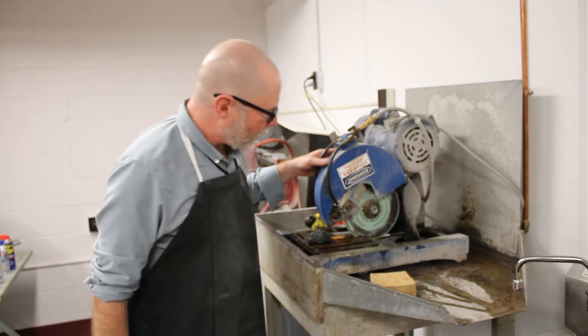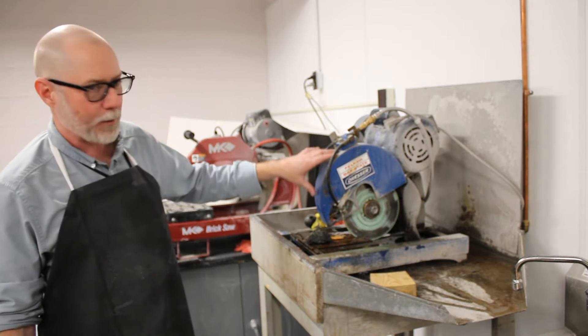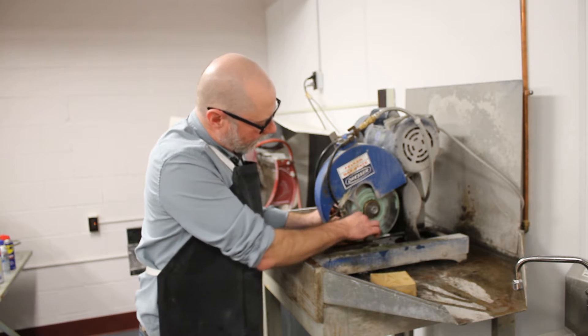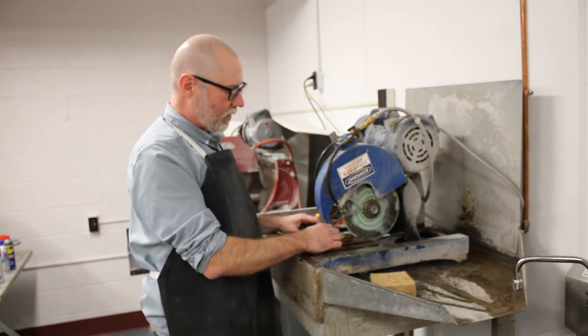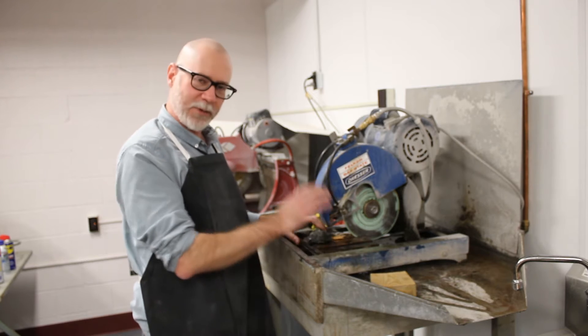This is one of our diamond-bladed rock saws. We actually have a couple of these — this is the smaller one, our trim saw. This is the same kind of saw you would use to cut tile. These are diamond-embedded blades. They're not actually sharp to the touch; they really cut just by abrasion. That allows us to cut through rocks relatively easily as long as we go fairly slow.